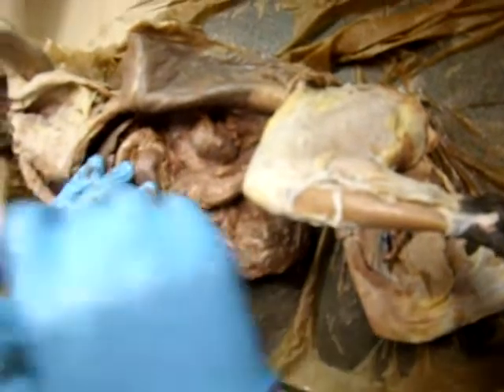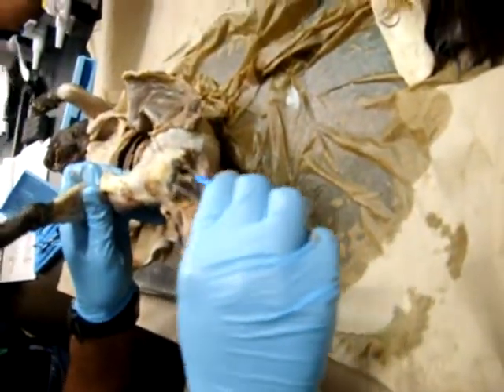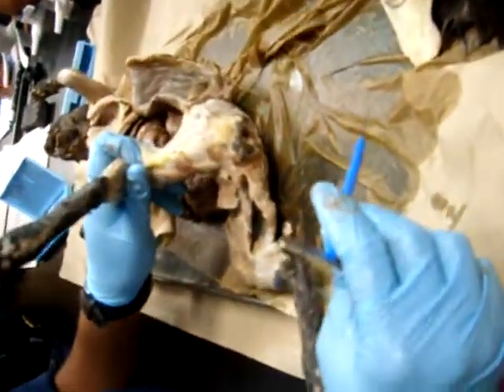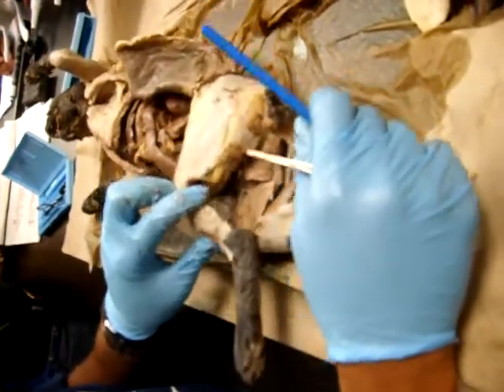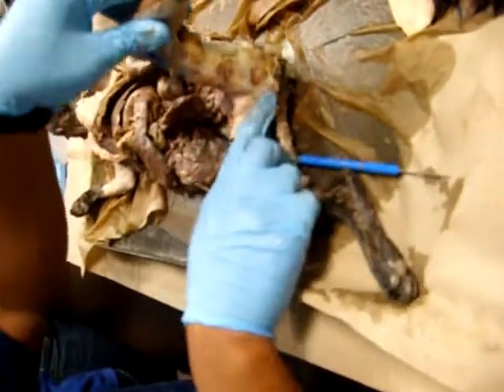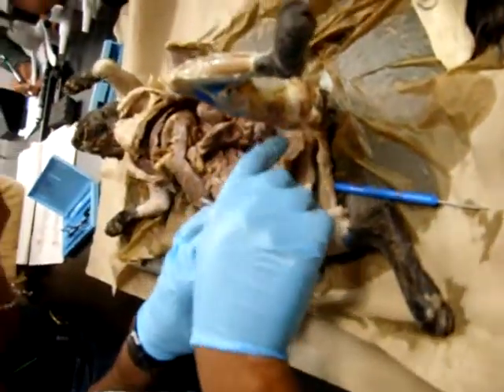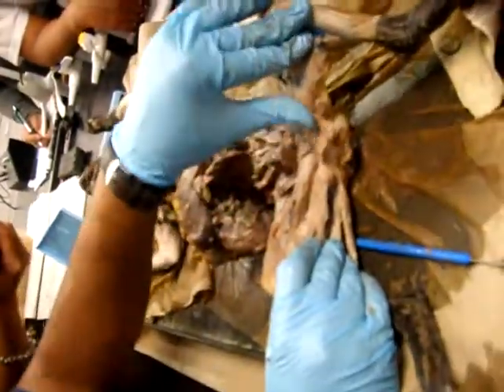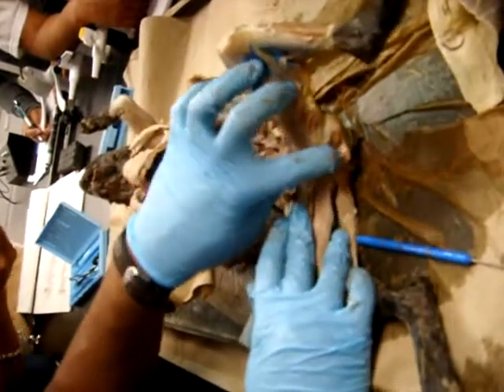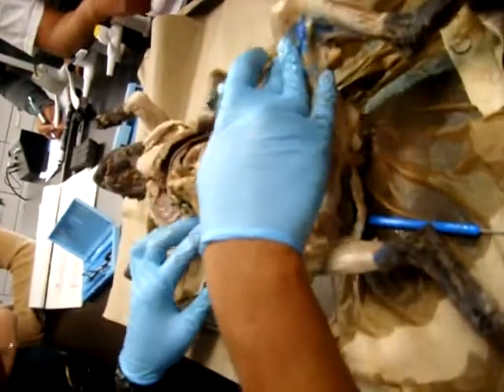Okay? Moving on. Anus. Everybody knows what the anus is, right? Butthole. Now on the cat, the male and the female parts, obviously, if there's a penis or testes there, I'm not going to do tiny structures. Just your basic testes. Basically.